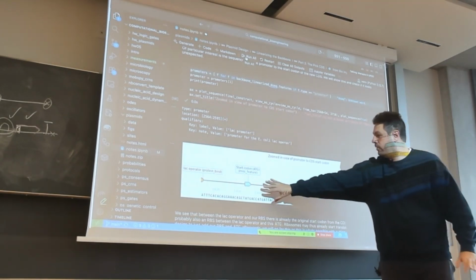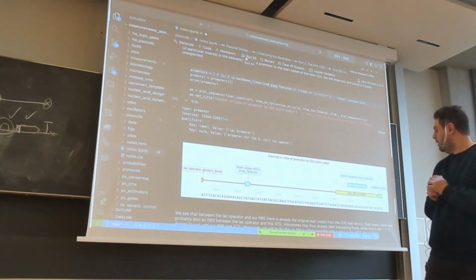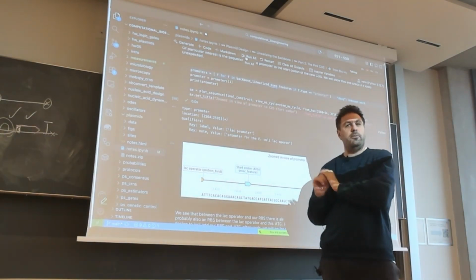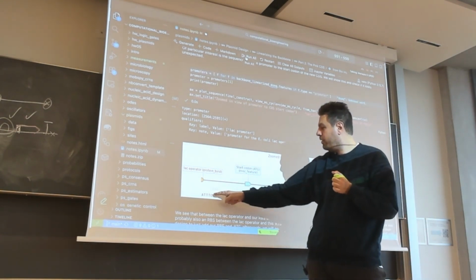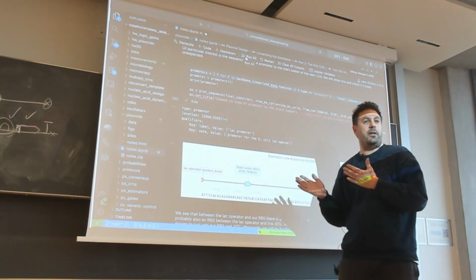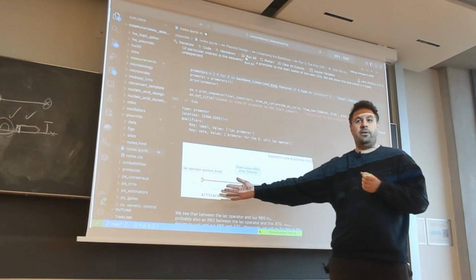Of course, it's still here, but we have just annotated the starter. So what is probably present here, and you will find that out in the problem session, is probably a Shine-Dalgarno sequence. Because it was working, right? There was the operator, there was the start codon, so probably there is a ribosome binding site here.